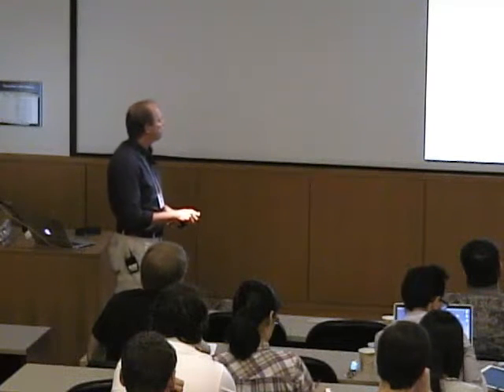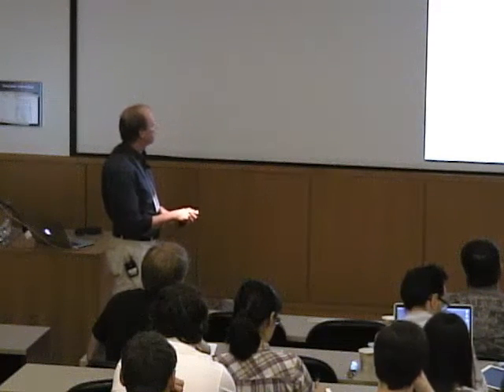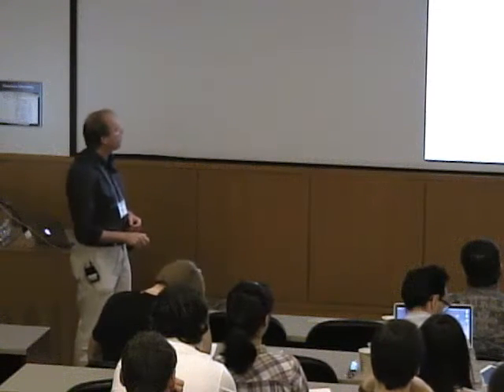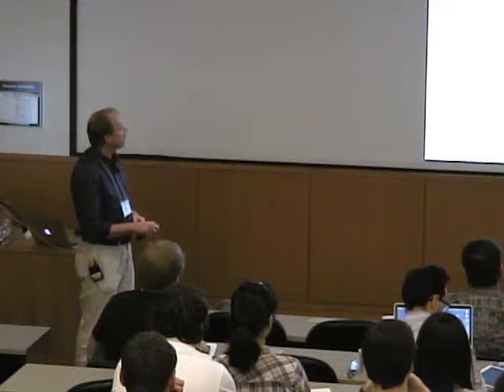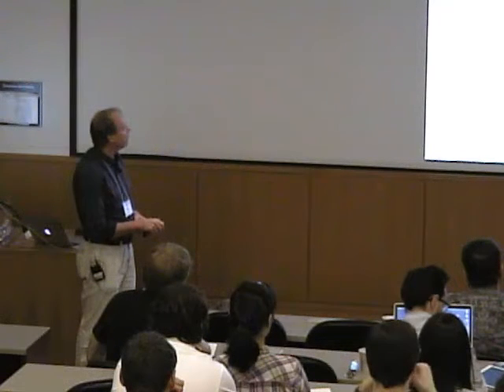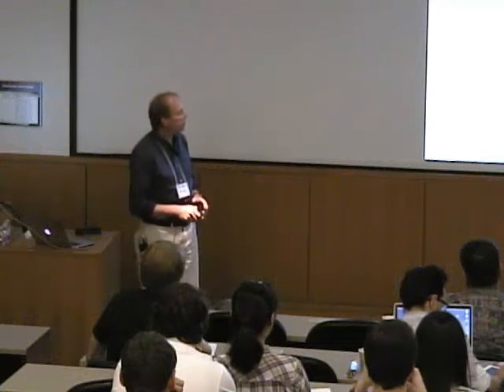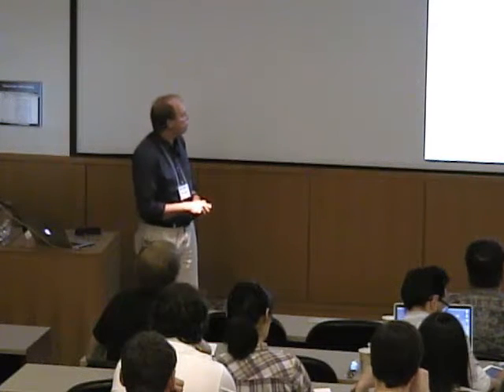So I have a spin magnetic moment and an orbital related magnetic moment. And these two have slightly different forms. They look very similar, but this factor G is equal to 1 for the orbital angular momentum. Right? So if I'm measuring an electron, what I will measure is the interaction of the total magnetic moment, which has these 2 components associated with it.